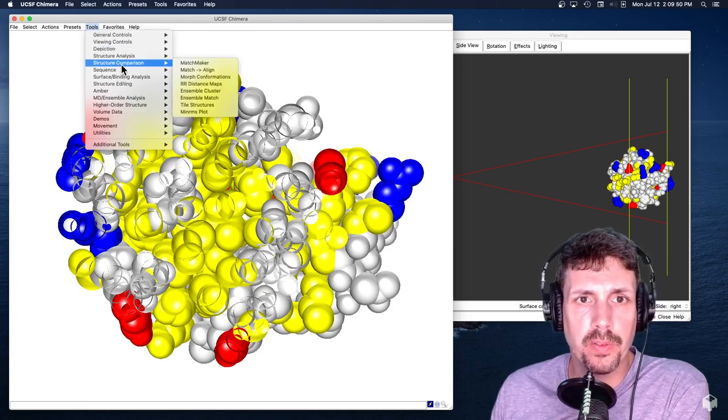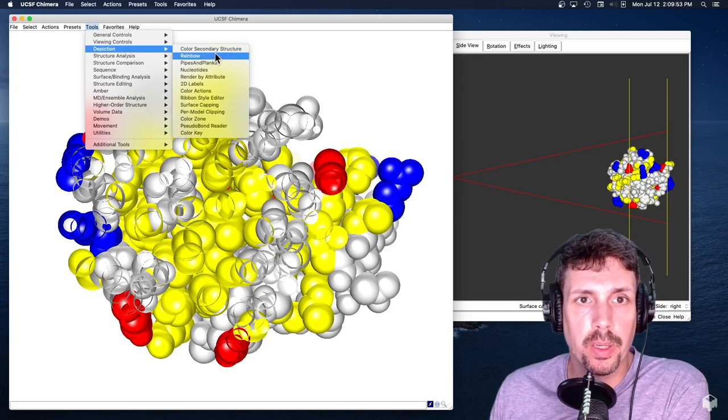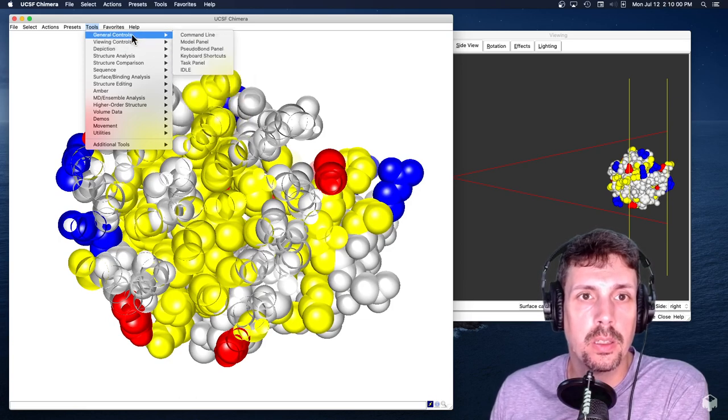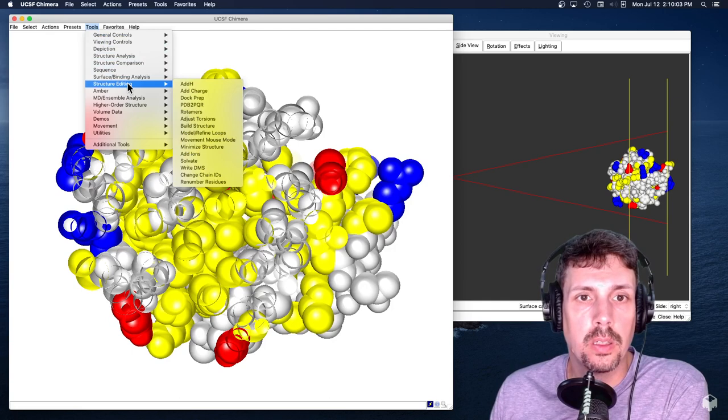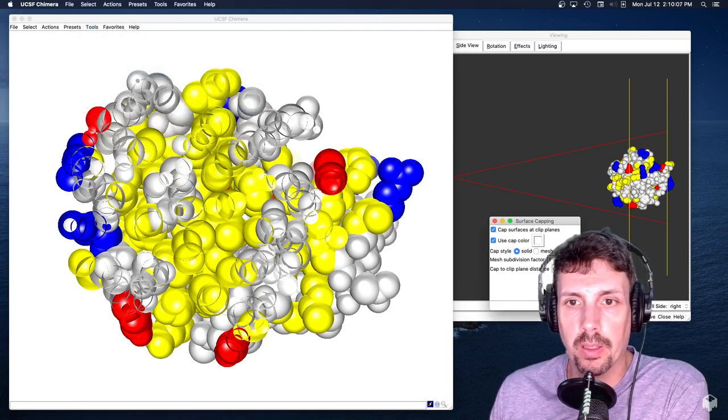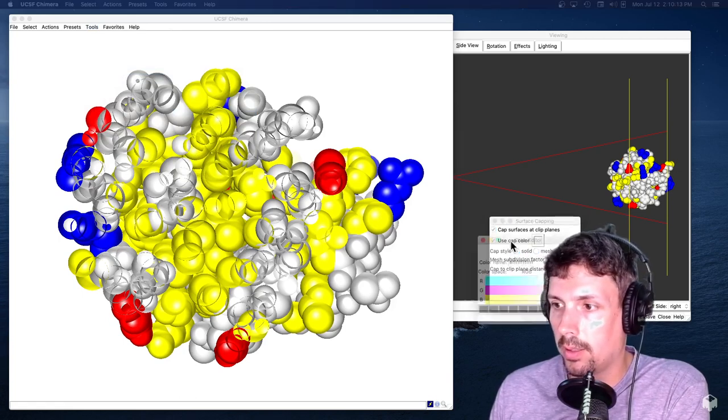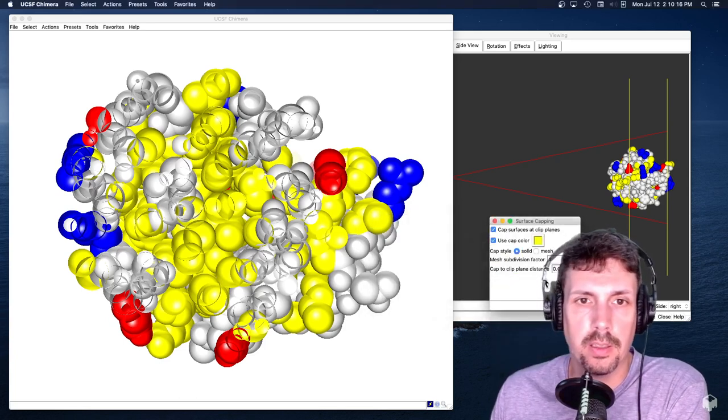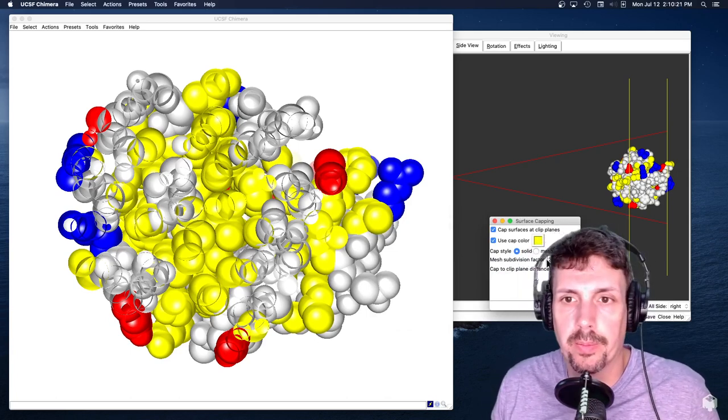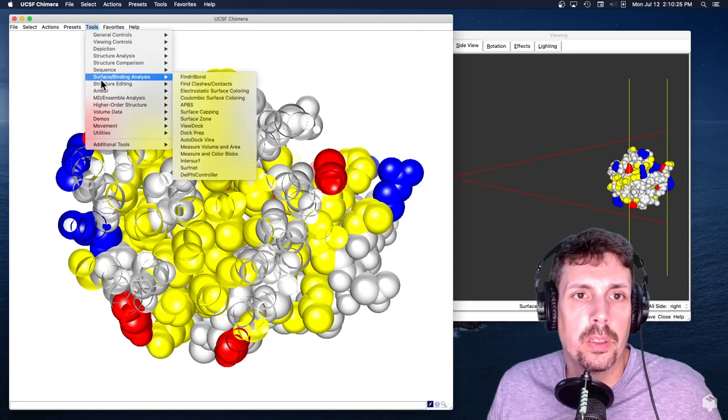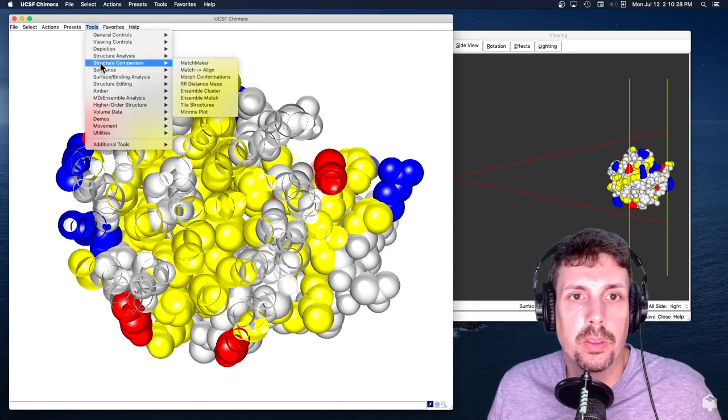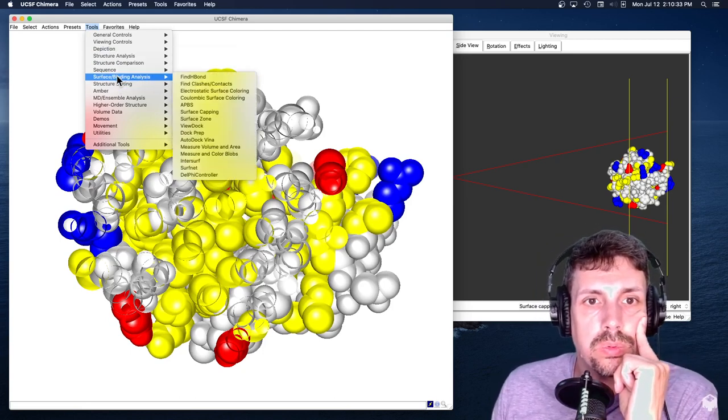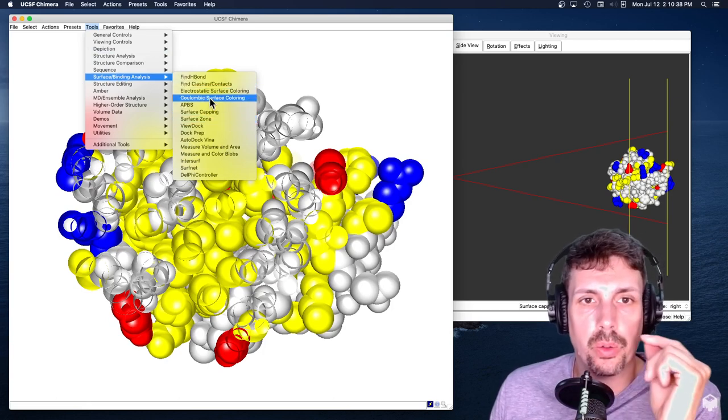So let's look for if you can find the surface capping depiction. Surface capping. This just opens up the same thing. This just opens up a color editor. It doesn't appear to be doing anything. So that was in structural analysis. No, structural editing. Surface capping. Surface. So one of the things I know you can do.